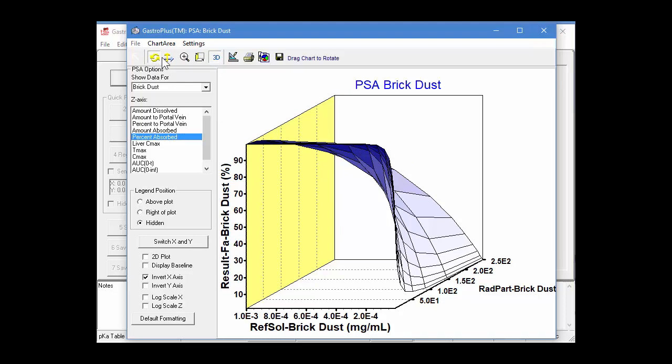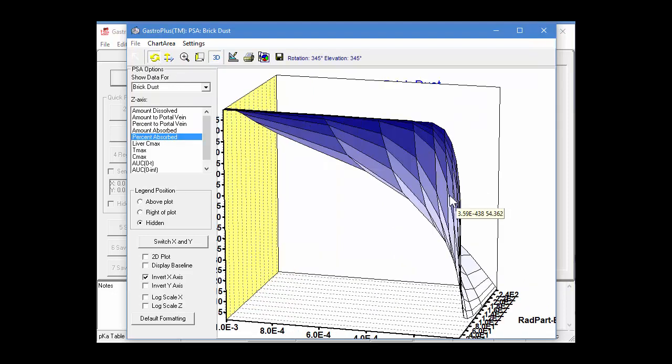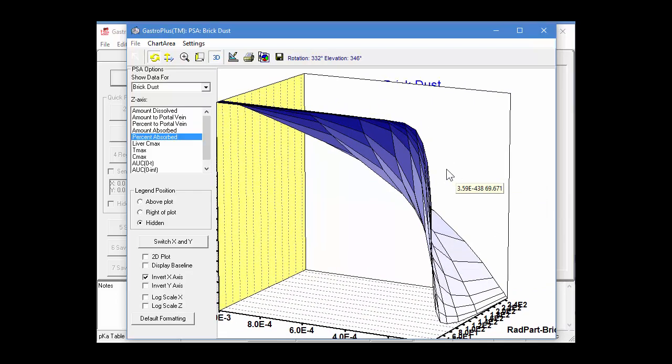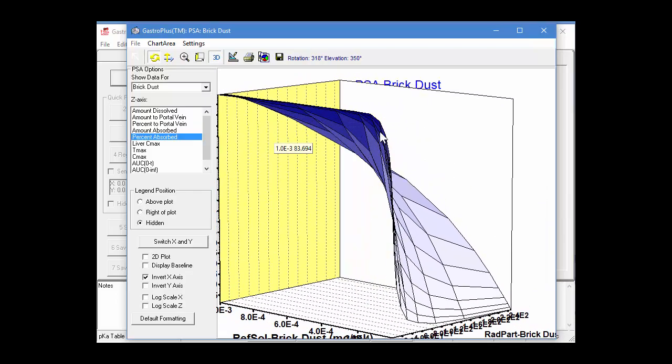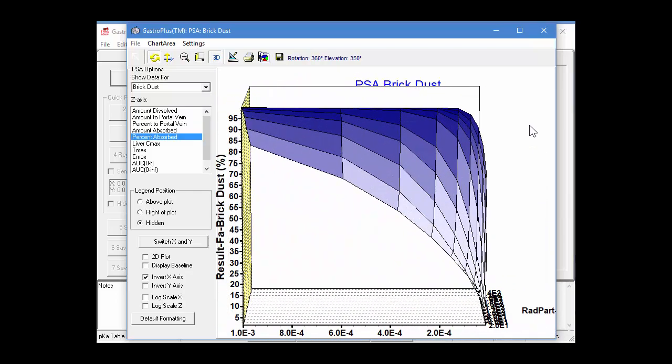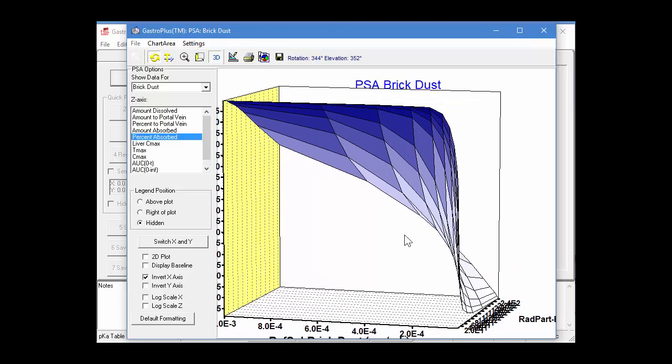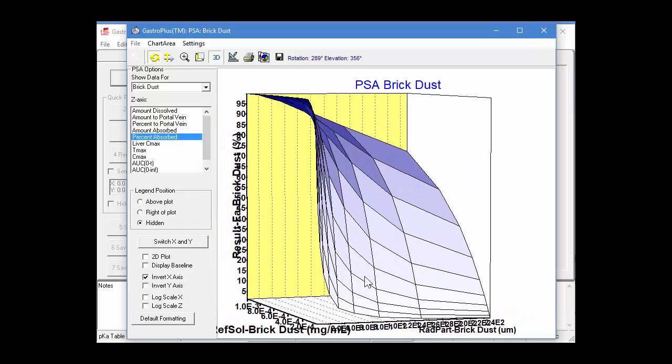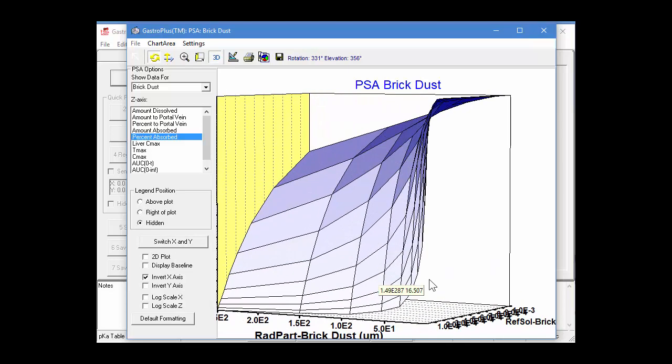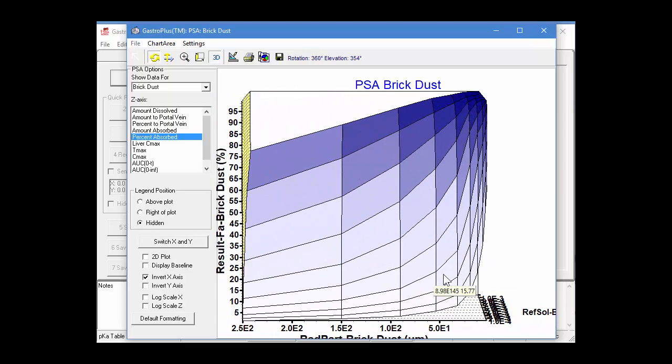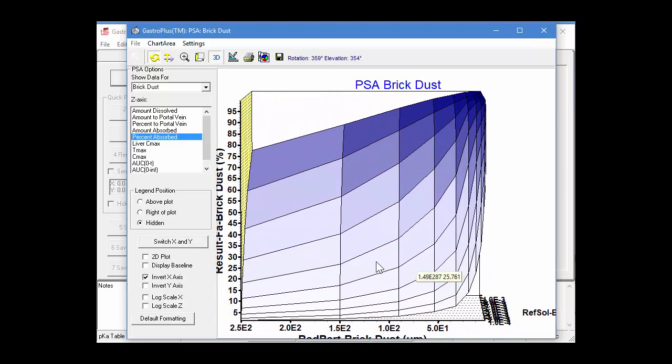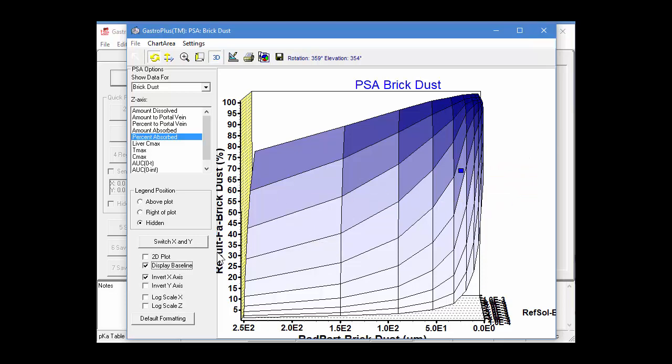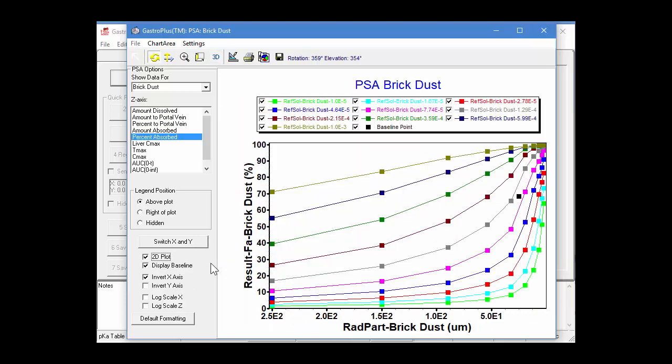Now, if you click on this button here, that allows you to rotate the graph around. So, you can simply hold your left mouse button and rotate it around to see the different views of the graph. We can switch the X and Y so that we get kind of a different picture of the 3D plot. You can also display the baseline point. So, this is the initial point for both of these properties and then varying them in either direction.